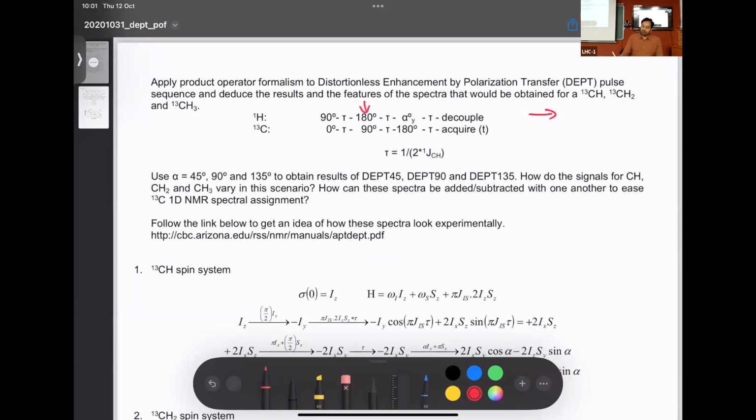And the main reason why this pulse program was actually discussed was the active Hamiltonian that is present, which will be a combination of chemical shift and the weak scalar coupling. We were able to appreciate that in the first tau 180 tau, proton chemical shift will not evolve. So therefore, we did not evolve it.